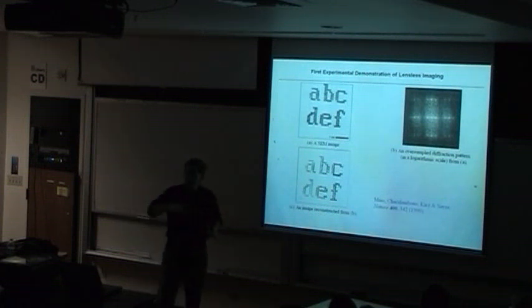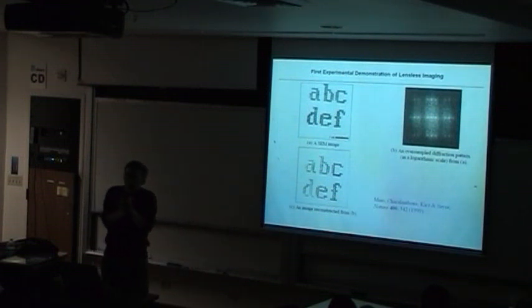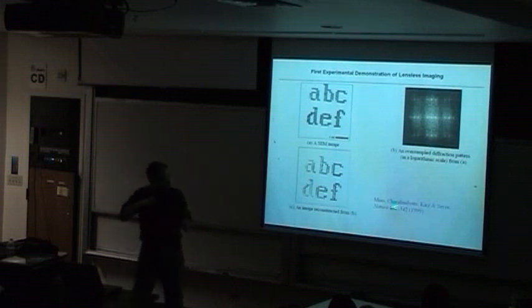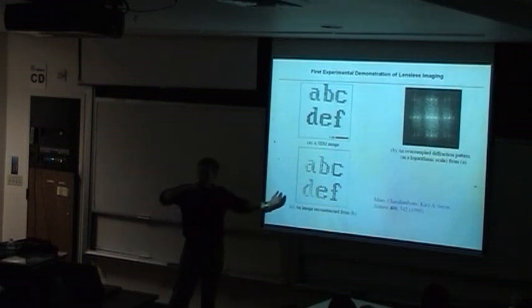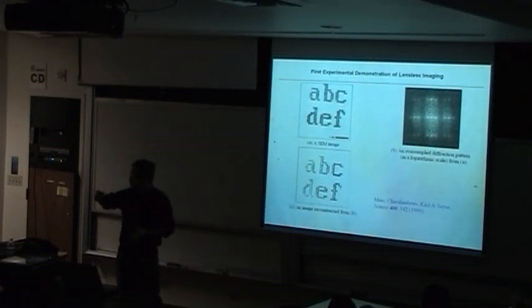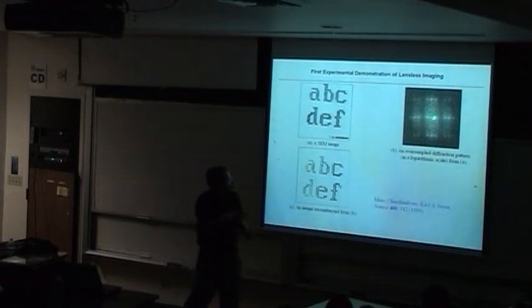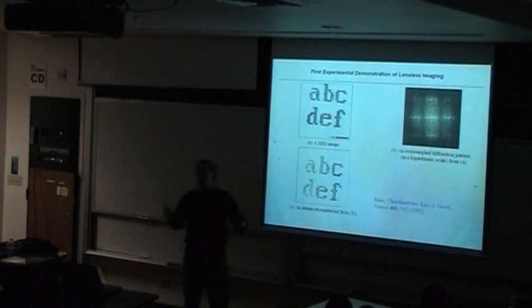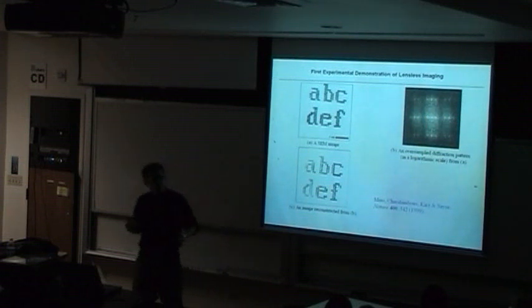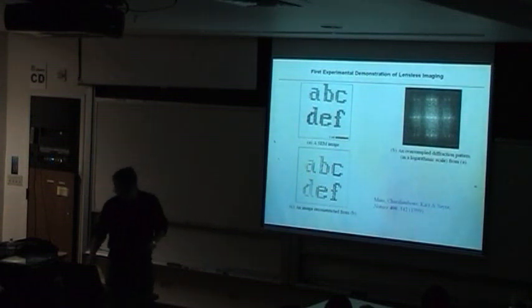Now our method doesn't use a different wavelength, but uses a special angle because our direct beam is blocked. It's much smaller than the diffracted beam. Our diffracted beam covers the whole CCD chip, but the direct beam is just a few pixels. So the signal is all from the sample, and there's no DC term. I think this is very important. This is why the contrast is so clean: there's no background, and no DC term.